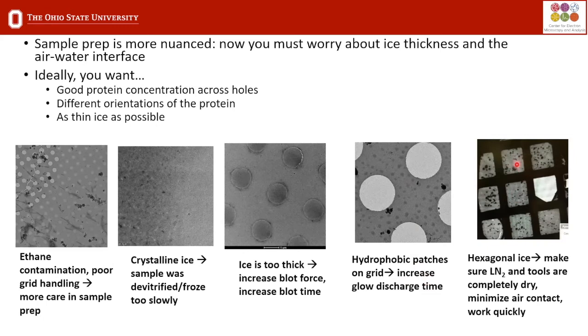And then these black crystals, sometimes you can even see them form hexagons. This is contamination at the air-liquid interface of your nitrogen. If it's a really humid day, water vapor from the air can get into your liquid nitrogen and contaminate your sample that way. Or what I see more often is people will use their tweezers, have something in the liquid nitrogen, take it out of the liquid nitrogen, and then dip it in again really quickly.